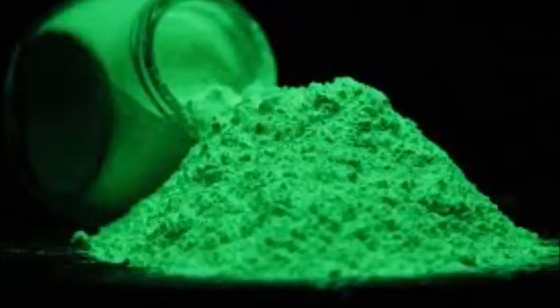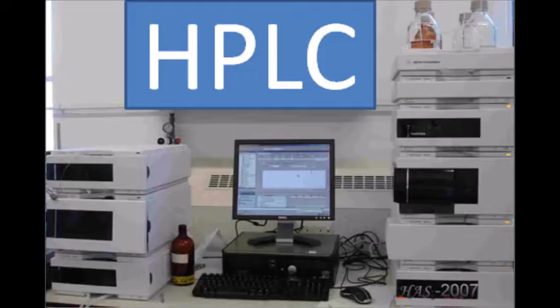Solid phase probes are very useful when paired with a flow system like HPLC. Using solid phase probes as a detector for HPLC increases the accuracy and specificity of the analysis. The benefits of solid phase luminescence are again the speed and sensitivity of detection. The solid phase can be reused many times, and batch methodology can be implemented to determine large numbers of samples. Due to the sensitivity of the analysis, there comes a need for specific probes and conditions for each analyte in question. This increases cost, time, and expertise needed to produce an accurate and sustainable result.